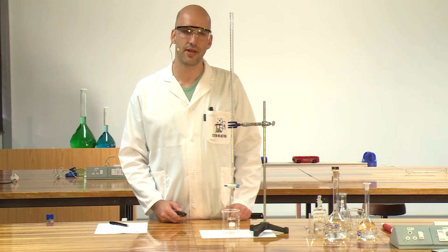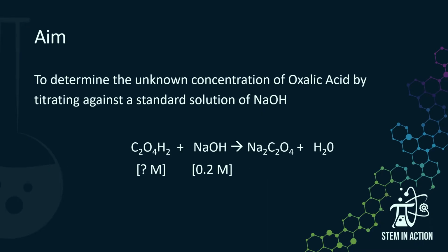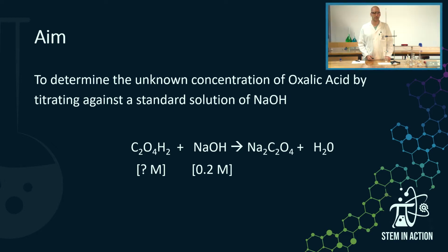As part of the STEM in Action Boost series, I'm going to demonstrate a titration for you. As with all experiments, we need to start with an aim. The aim of this titration is to determine the unknown concentration of oxalic acid by titrating against a standard solution of sodium hydroxide.